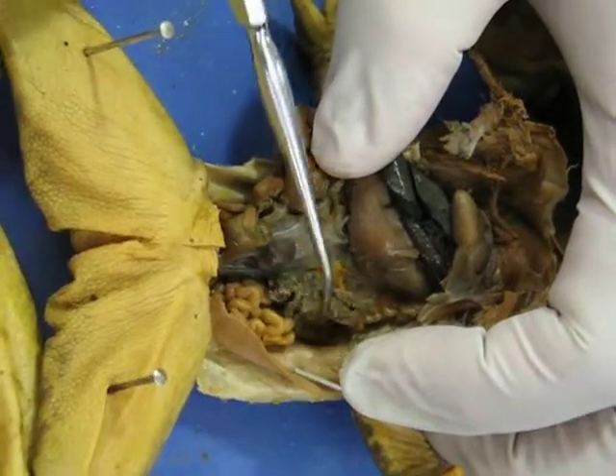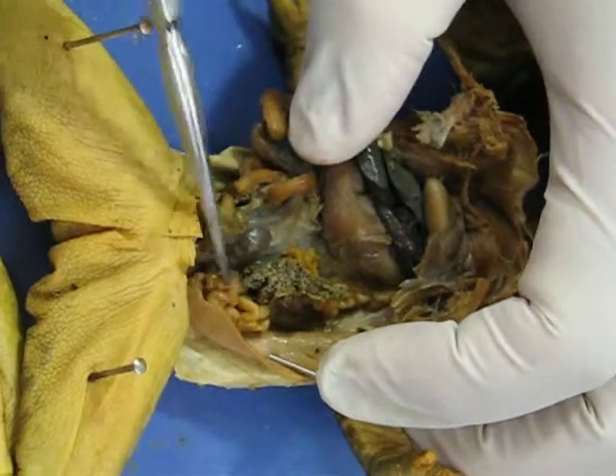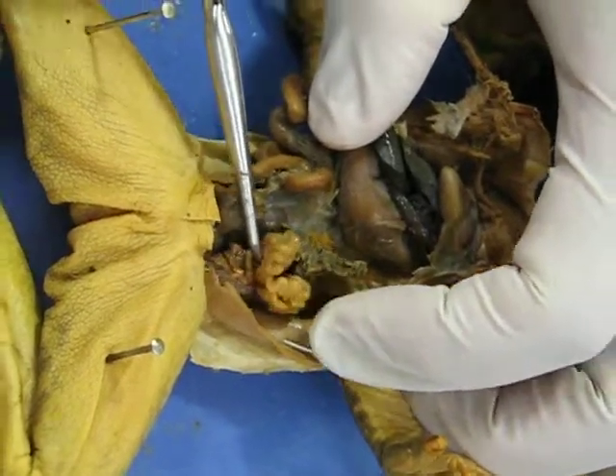The structure on the side here — these are ovaries with eggs. And all this right here is the oviduct, although that is not asked on the exam.